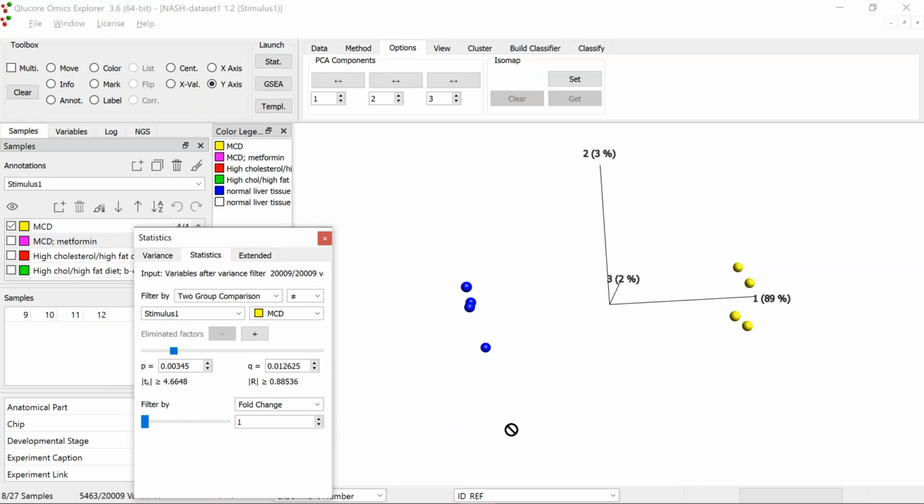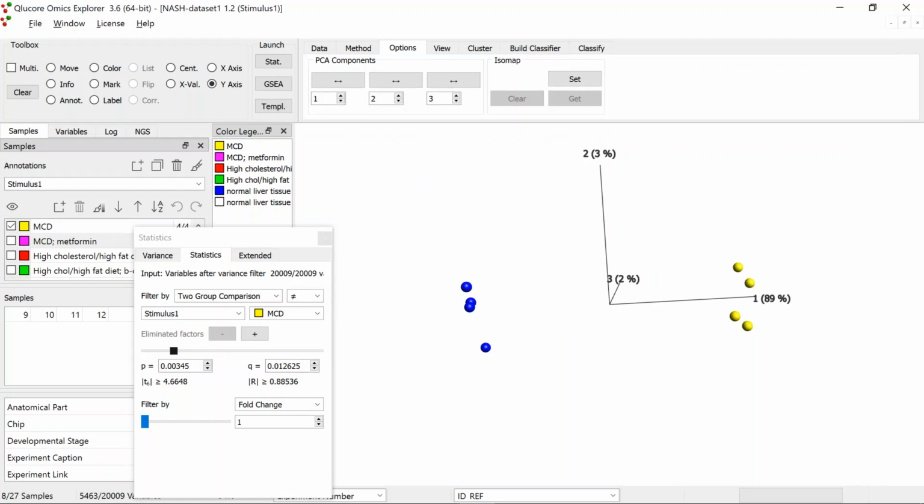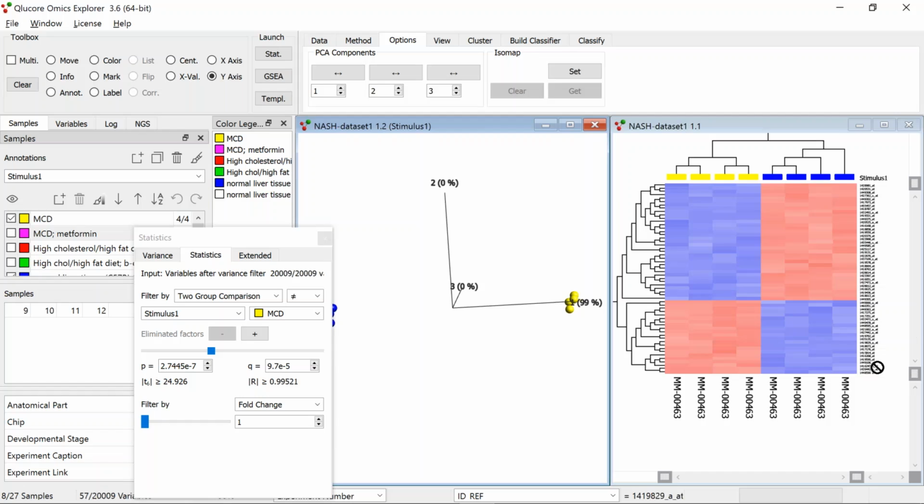That's a lot. And I have them, okay, I don't see them in the heat map yet, but I want a shorter list. The gene signature that I want to export to Genevestigator, I want that to be around 50 genes or so. So let's just try to achieve that. Like that. So 57 genes, and I can also have a look at them in the heat map here if I want to.